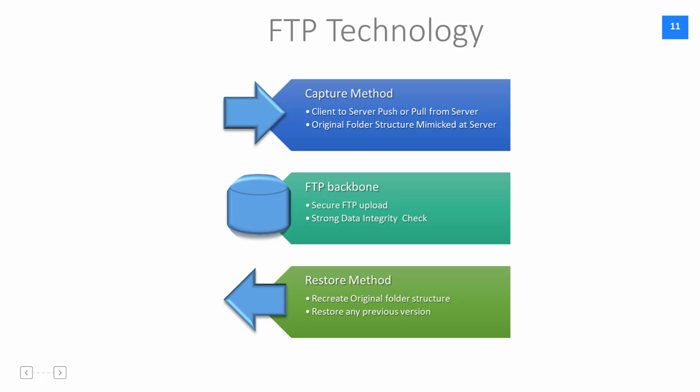LogiLab SDMS services can run on the server and pull data from the XP machine or a Linux machine into the server. The push mechanism works in a way where LogiLab SDMS upload services are installed in respective client PCs, which are monitoring the instrument generated data, and once they find the data, they push the data from the instrument side to the server. This means LogiLab is very unique, where you will be able to do push and pull data generated by the instruments.